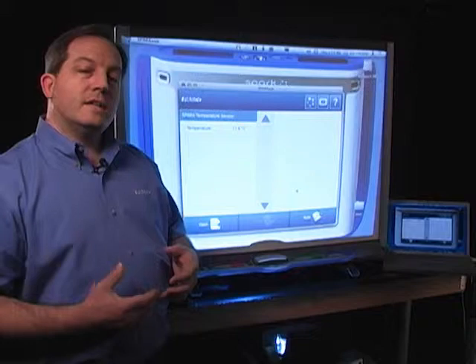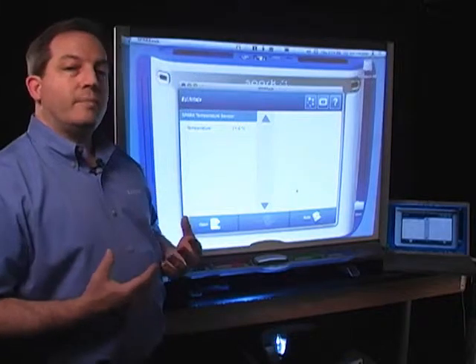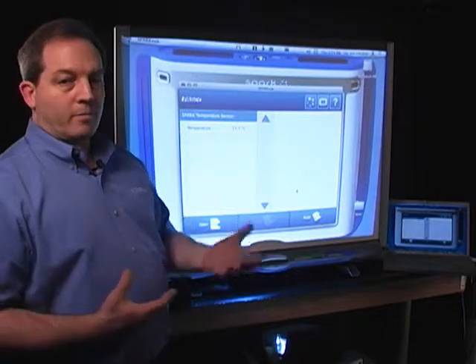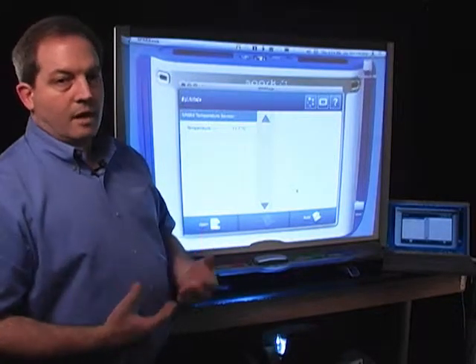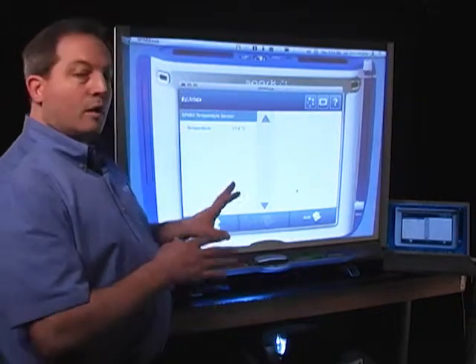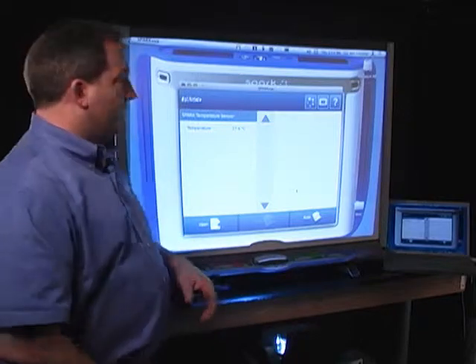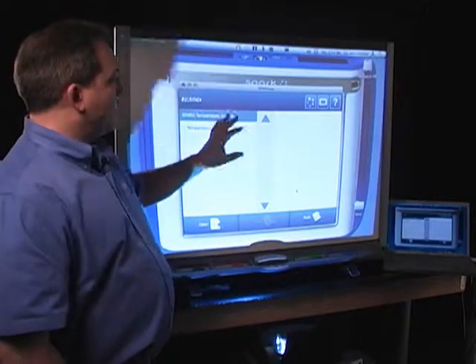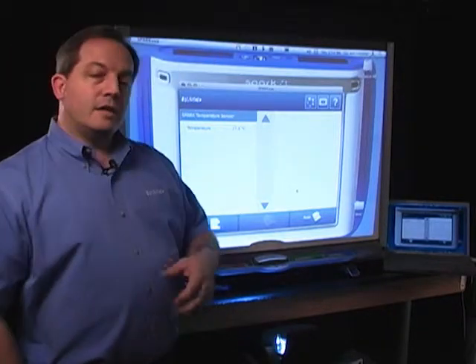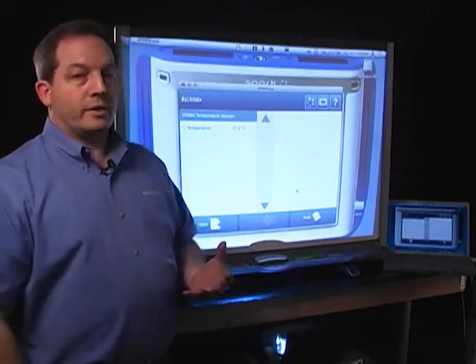Another key difference to be aware of is if I'm using the free emulation software from our website, that will only work with the Science Learning System. However, if I'm using SparkView like this, I can use it with any Passport interface.